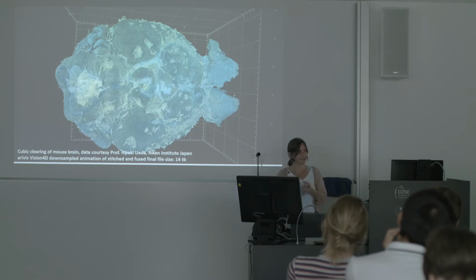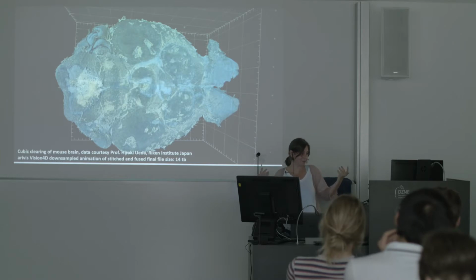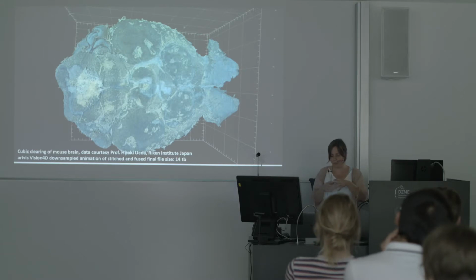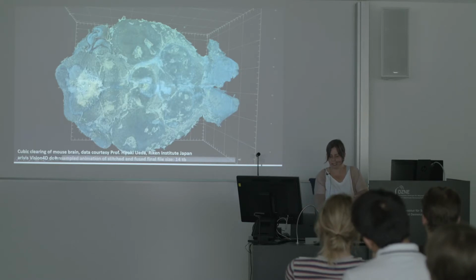They did what Mike is doing, like every 3 days, I would think. You stitch data, you fuse data, combine it to a large volume when you have the whole mouse. We did that for this data set, and as it is at a high resolution on a whole brain, the whole data set itself is then 14 terabytes, which is really incredible if you think about the numbers.